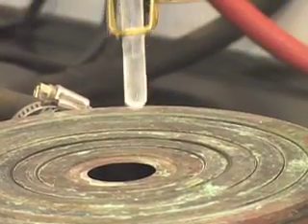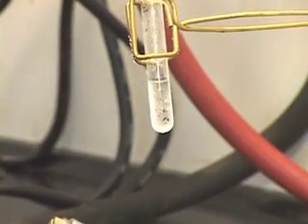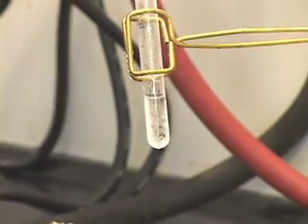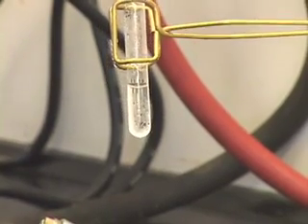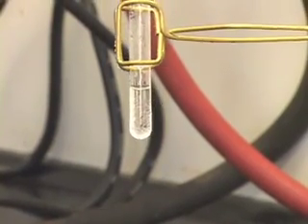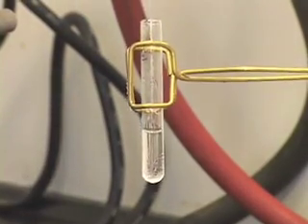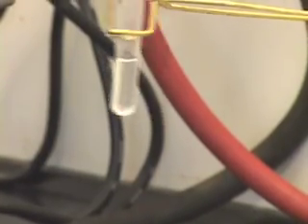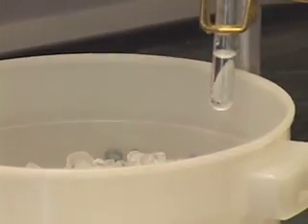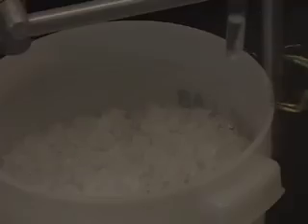Let us see what happened after we heated it in the steam bath — it looks like all of the solid has dissolved. It has now satisfied two criteria: the compound did not dissolve in the solvent at room temperature, and when we heated it in the steam bath, it dissolved. The next thing to do is cool this in the ice bath and see if the solid forms again, or if crystals will form.